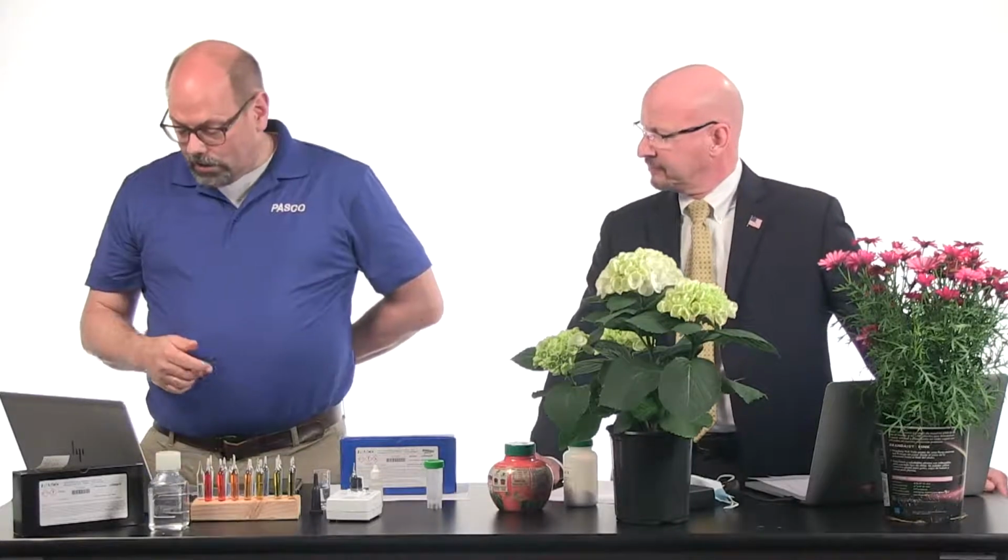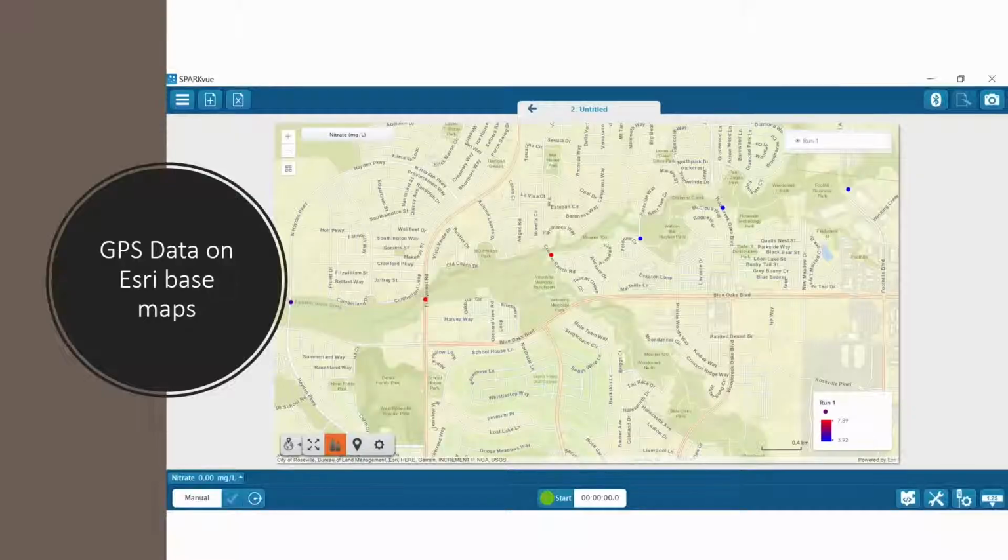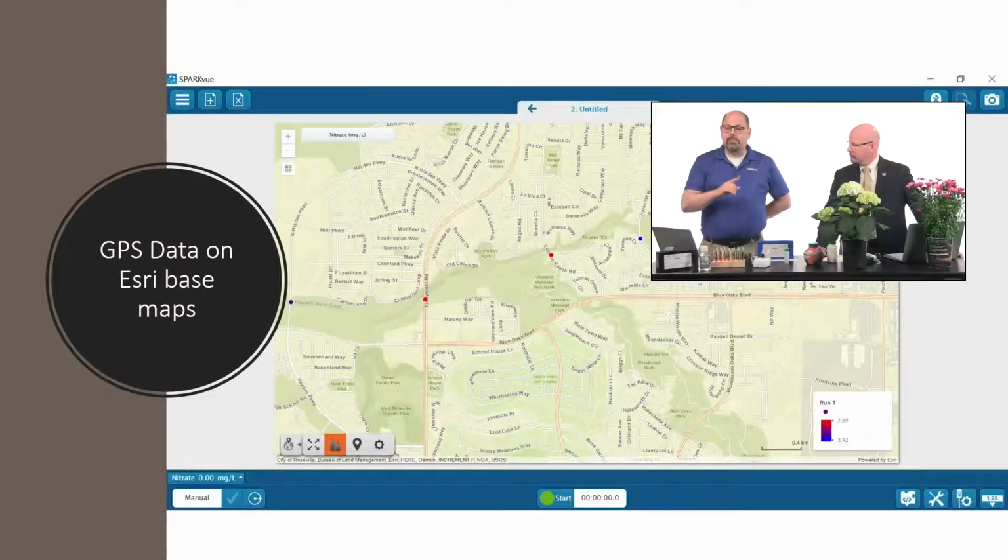Now here, after yesterday, I just went out to the creek, well, I didn't run, but I went to several spots along the creek. You can see in terms of the map, there are small dots on there. This is inside of our program. We have a map function. What's cool is that because we turned on the GPS and it was using the phone GPS, not another probe, just the phone GPS that's built in, it was saving the location, plus it's reading the value.